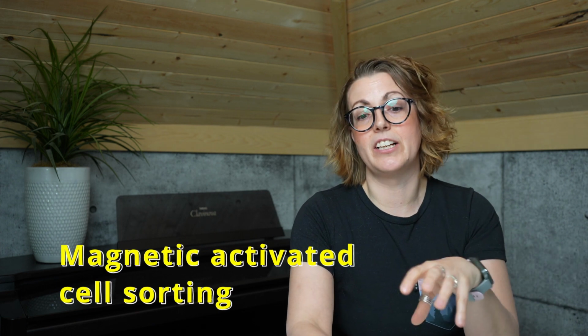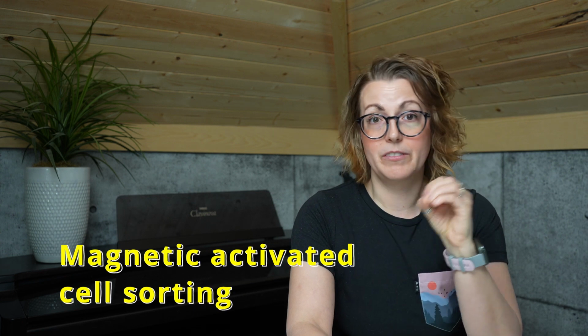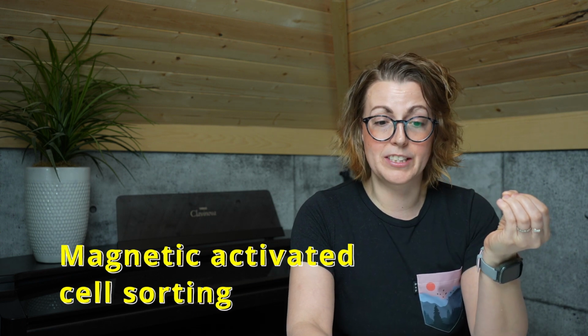Another method that you may hear of is called magnetic activated cell sorting, or MACS, and this uses magnetic beads that are coated with antibodies to specifically bind target cells, allowing them to be isolated using a magnet. Today, we're going to be talking about fluorescence activated cell sorting only. Let's take a look.